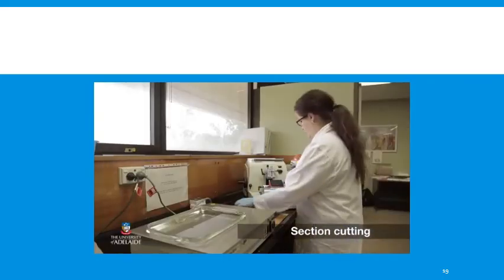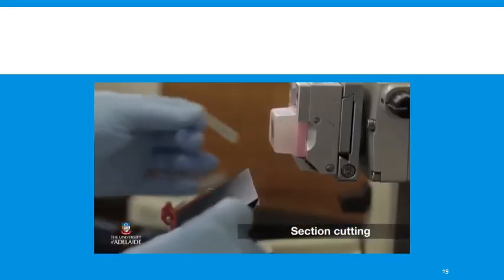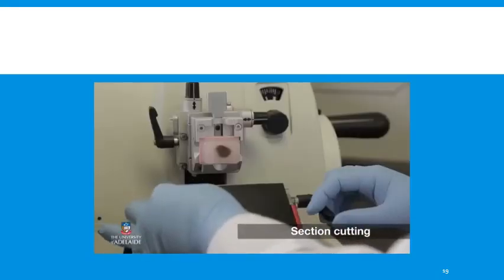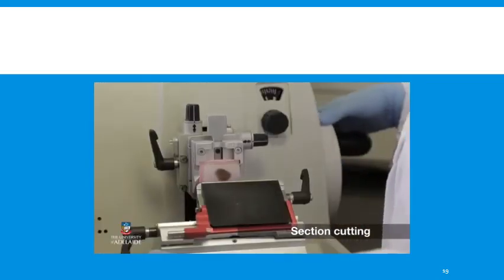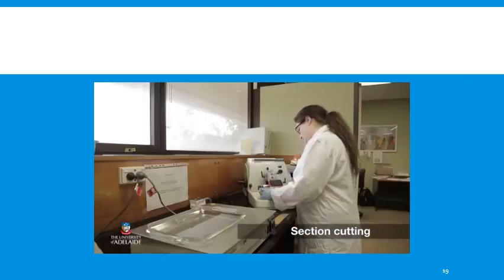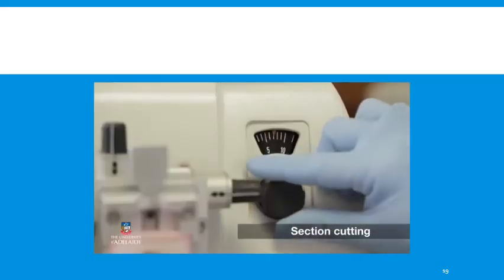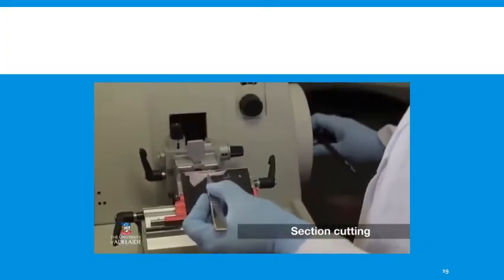Sections are cut using a rotary microtome. The tissue block is clamped into the microtome. The knife is inserted and clamped into the knife holder. The knife stage is eased towards the block. When final adjustments have been made, the stage is locked in place and the dial set at the required thickness, routinely 5 microns.